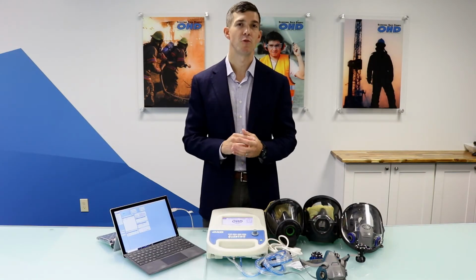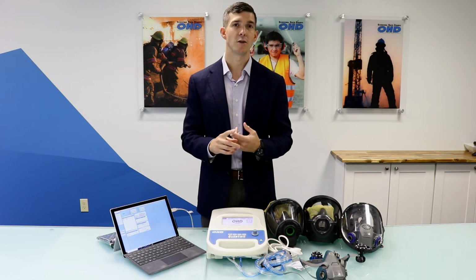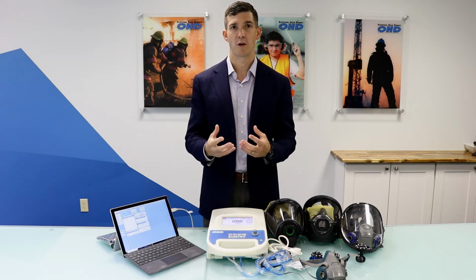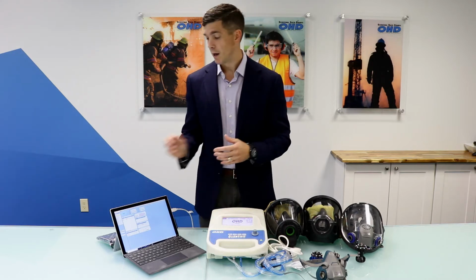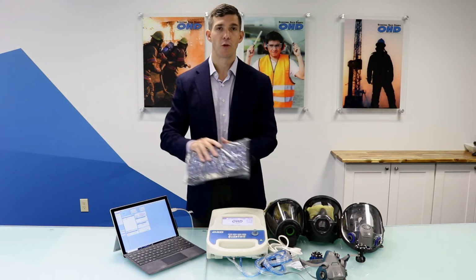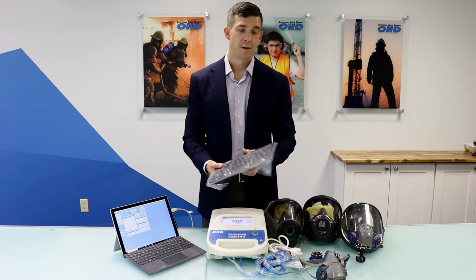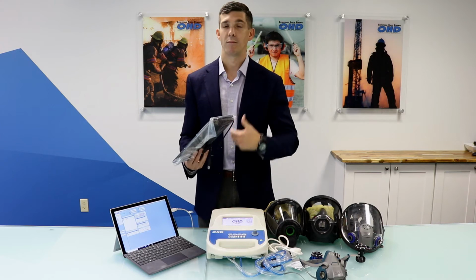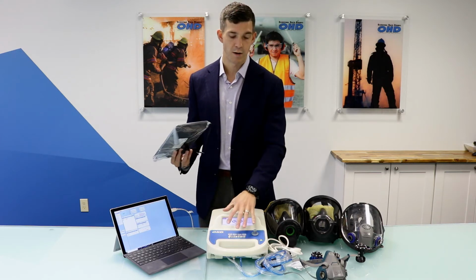So there's two ways you can run our instrument. The first is standalone. This is the least commonly used manner of doing fit testing with our technology, but I'll briefly show you how to do that. So I mentioned earlier that one of the components you get is a keyboard. This has a USB connection. You'll run into the back of the instrument. You can input data, contacts, company information, whatever, into the unit.